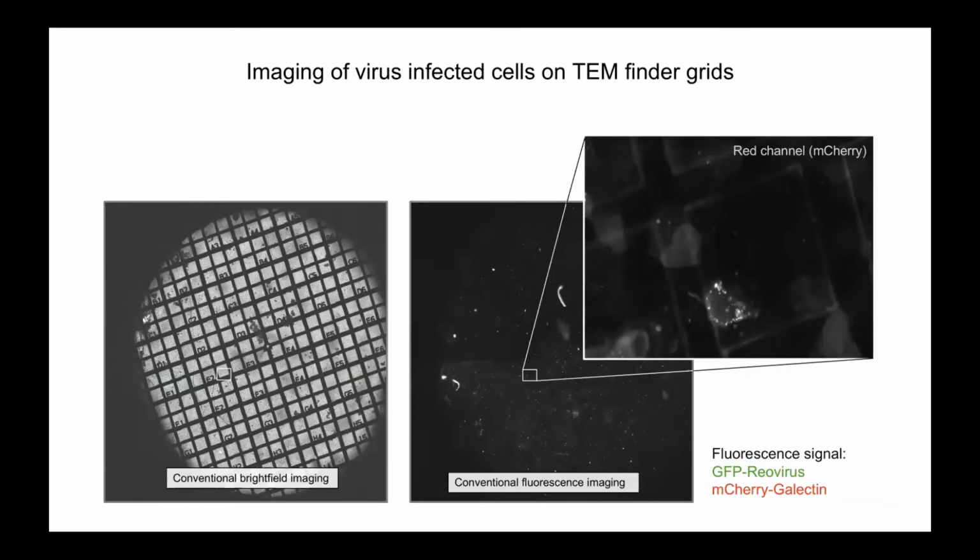Hence, the virus somehow made them leaky. So here you see the bright field, just white light imaging, and fluorescence, where I'm using the reporter molecule for fluorescence. In this box, you can see the single cell that contains this fluorescent marker. And if it reminds you of something, that's the one I used to show on the cryoSIM page.